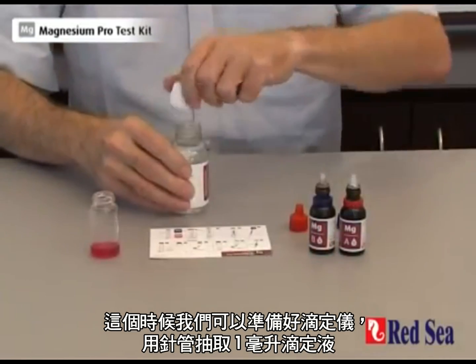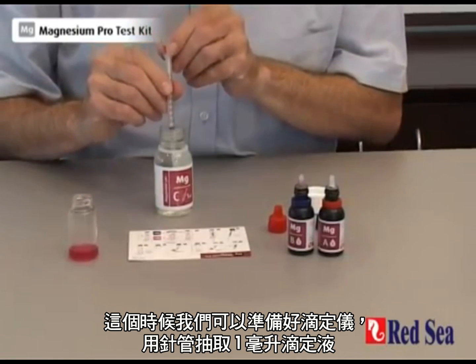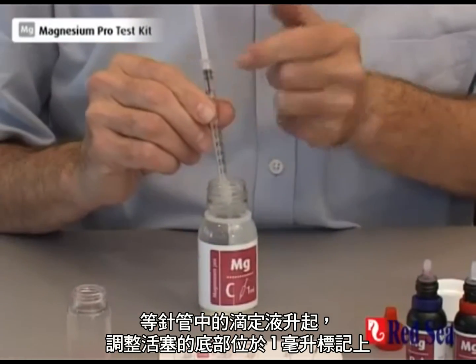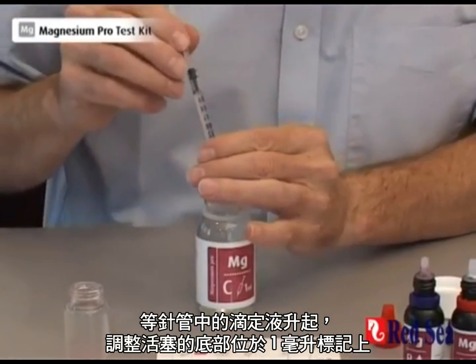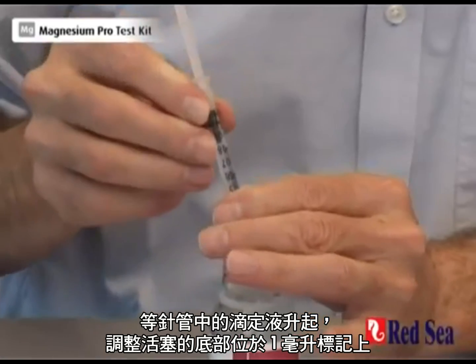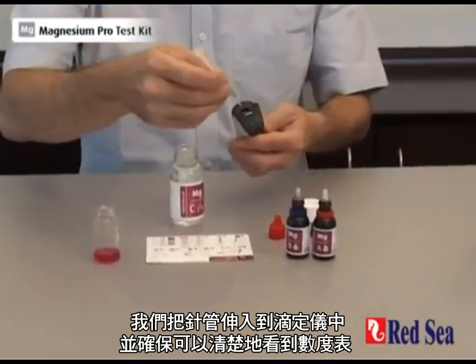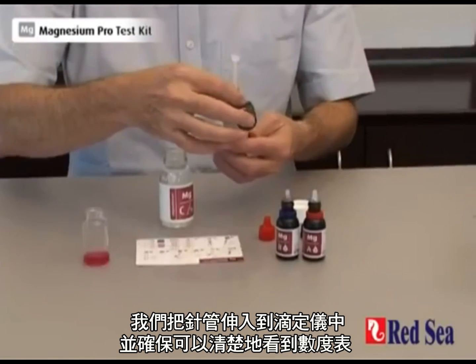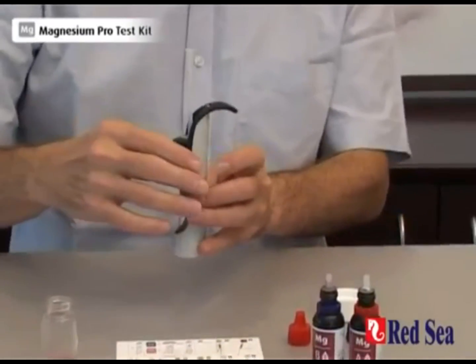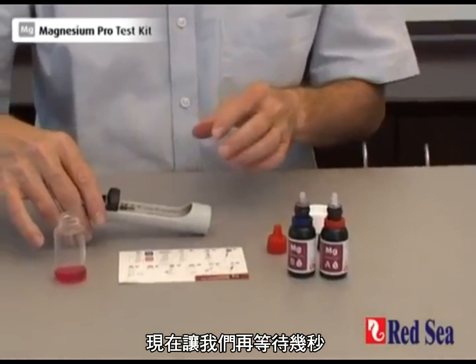In the meantime we're going to get our titrator ready and we draw exactly 1ml of titrant into the syringe. Wait for the liquid to rise up in the syringe and set the quantity with the bottom of the plunger at the 1ml mark. This is now ready to use. We place it into the center of the titrator making sure that the scale is visible. Now we just wait the last few seconds until we complete our 60 seconds.